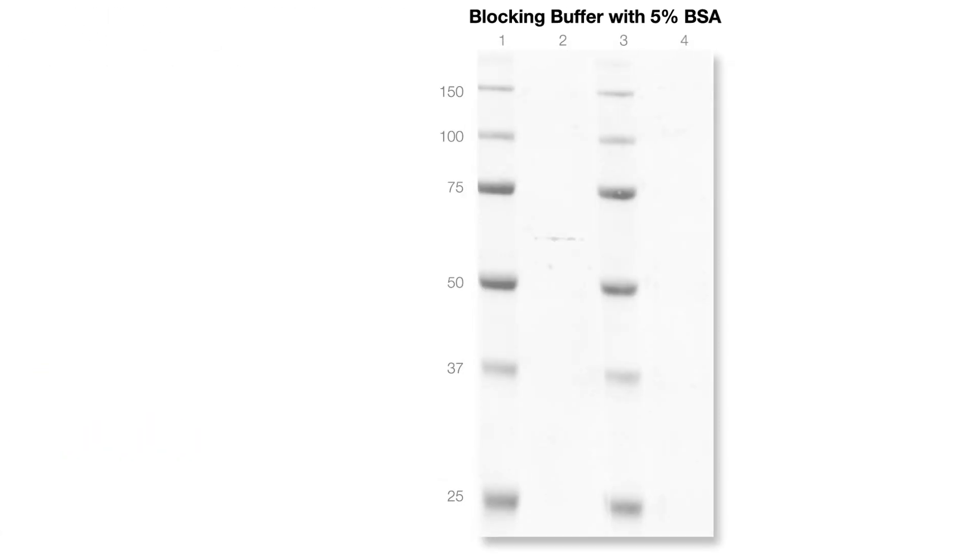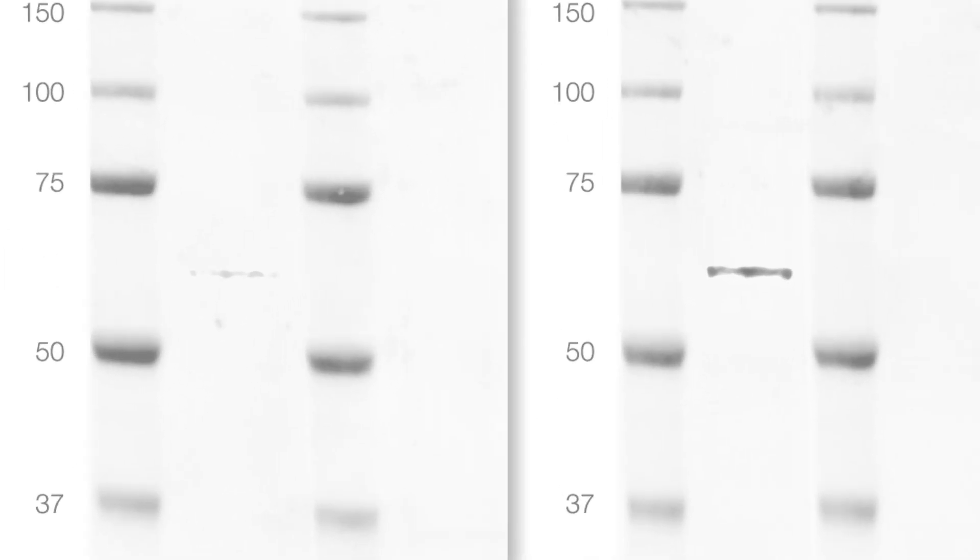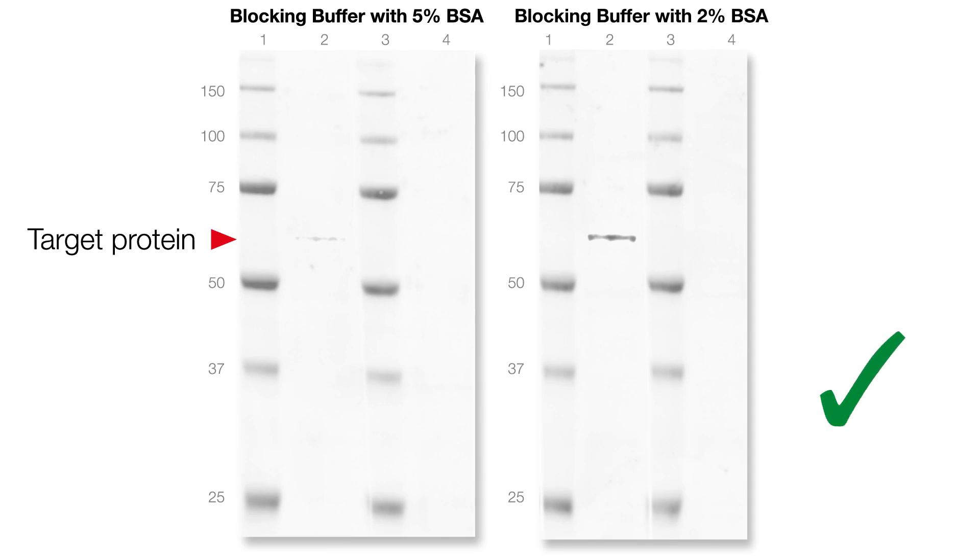You should also optimize the concentration of blocking reagent in your buffer. Using too much blocking reagent may reduce the signal from your target protein, while too little may lead to increased levels of non-specific primary or secondary antibody binding.